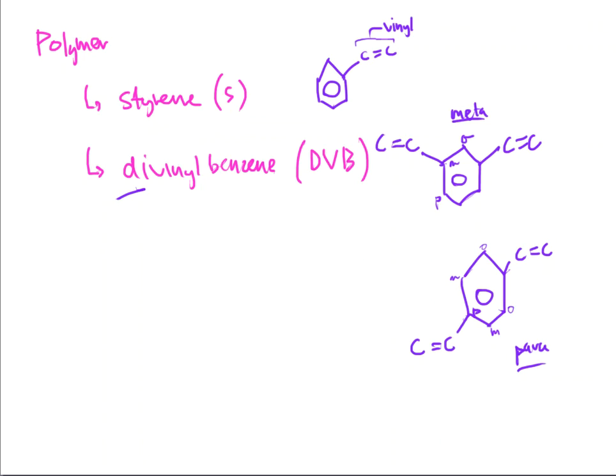These polymers are going to start connecting together. And they're going to make a big, long chain of styrene, styrene, styrene, or DVB, DVB, DVB. One after another, after another. I am going to write a third. It's not really that different, though.